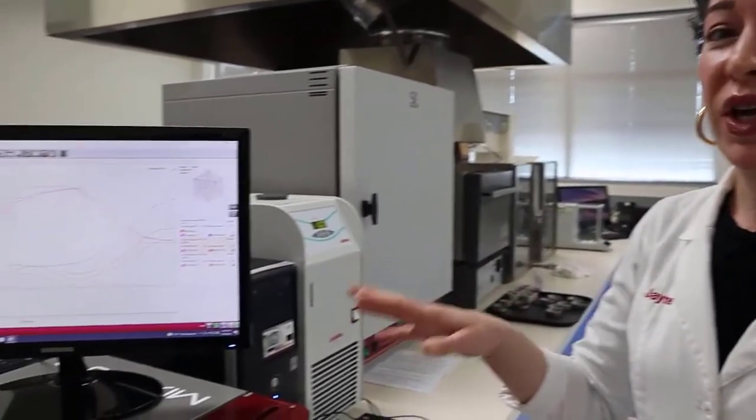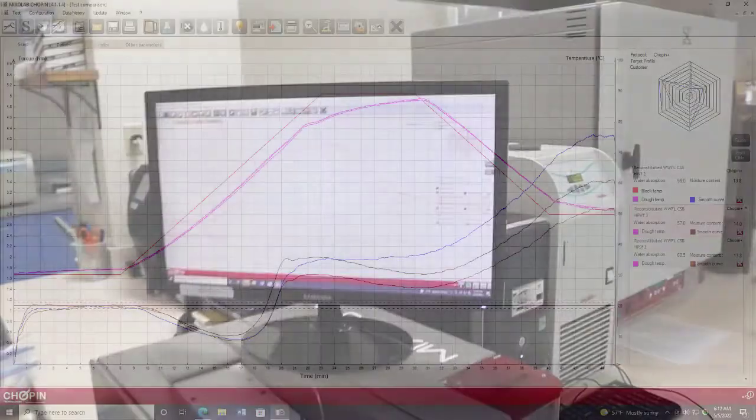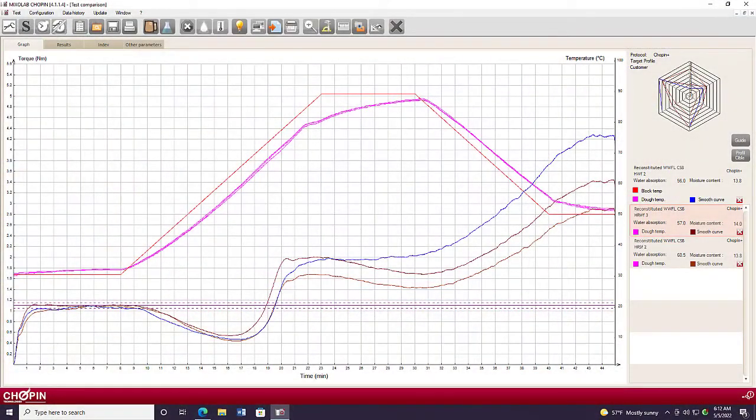But Jane, what if the flour does not fit the baker's specification? There are other functions in the software that will help the baker figure out directions that they can make. One of those functions would be the blending law function. So you can enter in all the flours that you have available into this function. And what it will do will help you figure out how you might need to blend those flours together to create a more optimal flour profile.